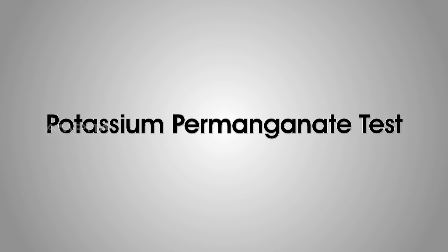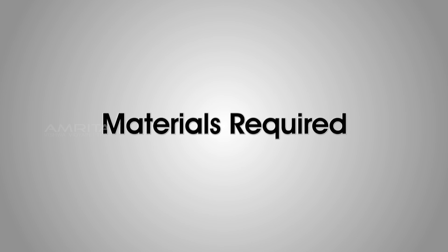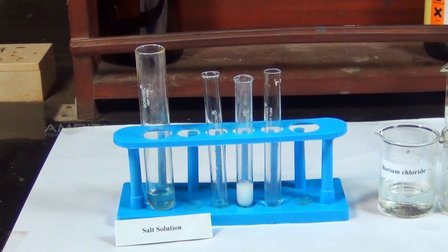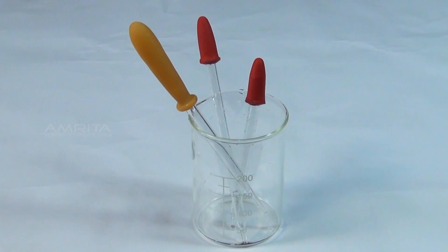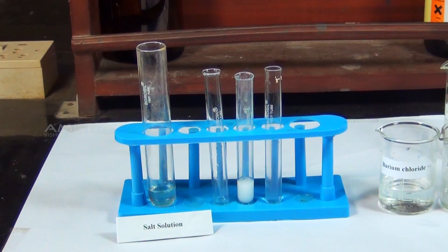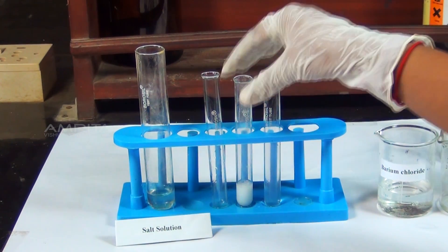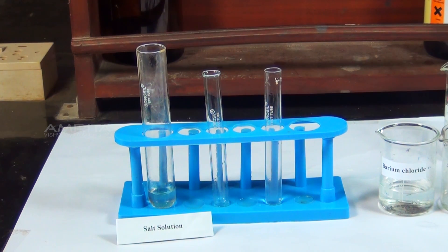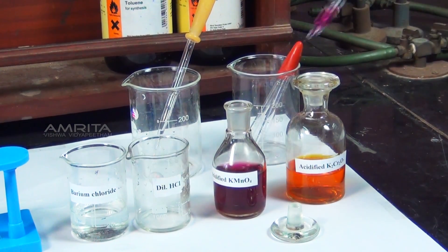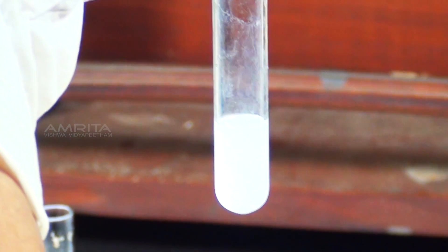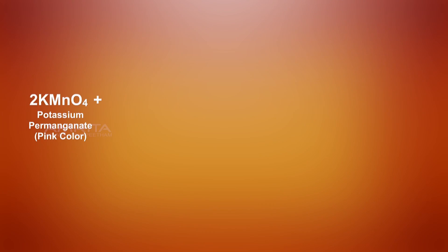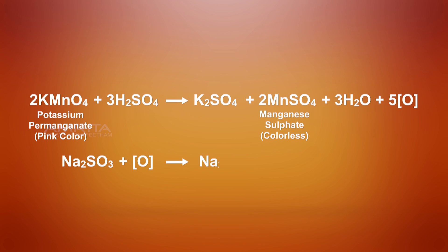Potassium Permanganate Test. Materials Required: Precipitate of barium sulphite, acidified potassium permanganate solution, test tube, and a dropper. Procedure: Take the second part of the white precipitate of barium sulphite obtained in the barium chloride test. To this, add a few drops of acidified potassium permanganate solution using the dropper. The pink colour of potassium permanganate is discharged because, in the presence of dilute sulphuric acid, sulphite reduces potassium permanganate to colourless manganese salt, and sulphite undergoes oxidation to form sulphate.